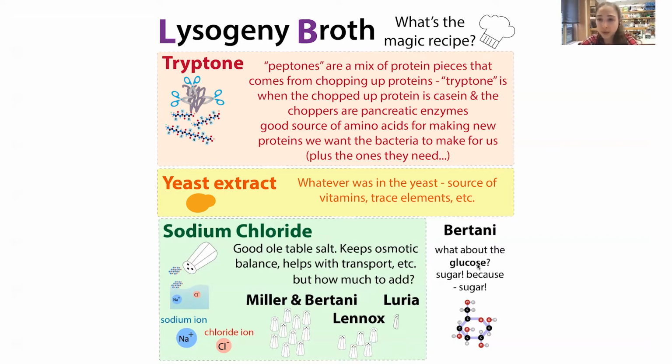Bertani's formula also includes glucose. The original formula has glucose, but nowadays the formulas typically leave out the glucose, although as we'll see, there are media where they have glucose in them. Bertani added glucose after the autoclave step. We'll talk more about the autoclave later. Autoclaving it together would cause caramelization and the Maillard reaction, reacting with the proteins, and this was inhibiting some of their bacteria. But anyway, most of these formulas leave out the glucose these days.